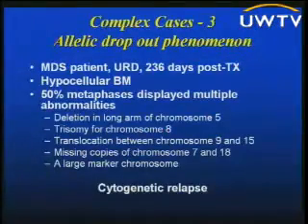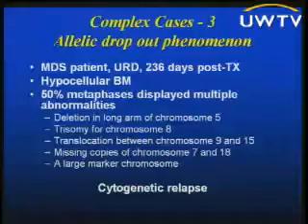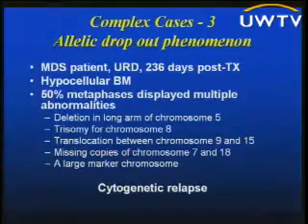And then occasionally we have this occurring. This happens usually with pediatric patients that are suffering from ALL, and about 10% of individuals that suffer from myeloid dysplasias. So it's not completely uncommon. What happens is that we observe this allelic dropout phenomenon, and I'll show you what this looks like when we're actually performing the analysis. So this was a patient that suffered from myelodysplastic syndrome, received a transplant from an unrelated donor, and about 236 days post-transplant came in, was really sick.